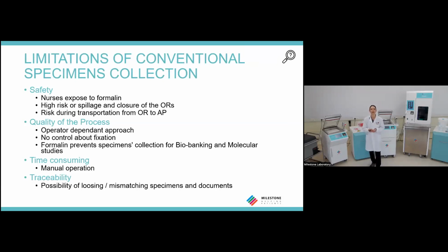Another limitation is that it is very time consuming for the nurses, who have to do many things, but they should stay most of the time inside the surgery room. They need them. Last but not the least is the traceability. Now it is a must to document all the steps from the moment when a tissue is extracted from the human body. This is always for the patient safety. If you don't document, if you have some errors, you cannot know what's wrong, and you cannot for sure solve it.